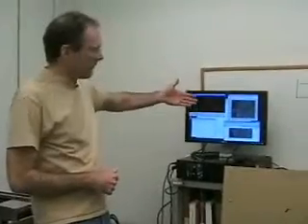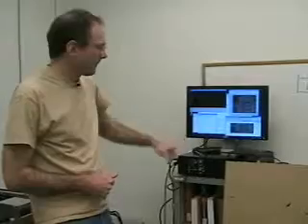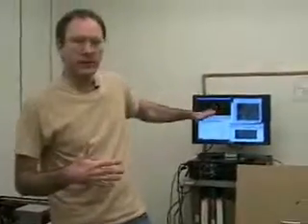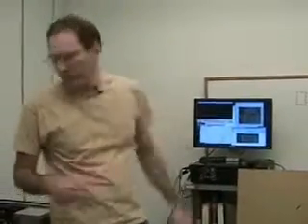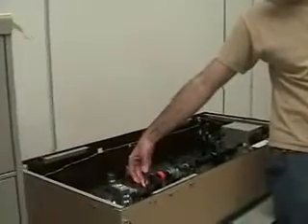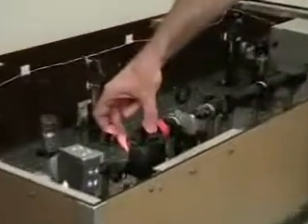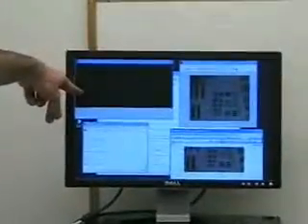And you'll notice that what's happened here is that the screen has now gone dark, right? I still have the leftover image of the test target, but there's nothing in the screen. The first thing you do whenever you're working with a sample is try and increase the light level to the point where you can see something, unless you're concerned about bleaching. In this case, we're not. This is just a random test sample, so I'm going to turn the light so you pick up a little bit of gray. I'm turning down the neutral density, so I'm increasing the intensity on the sample.